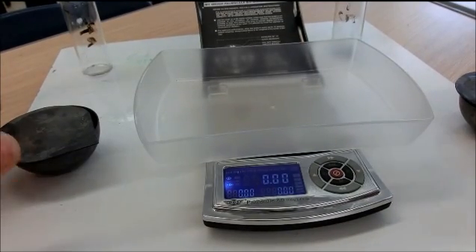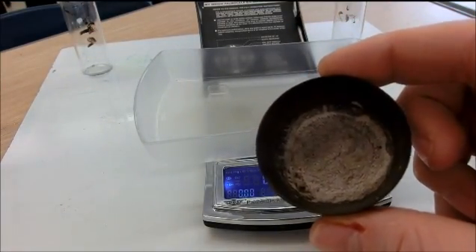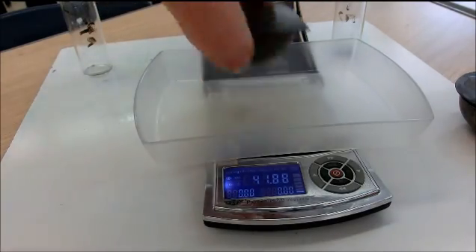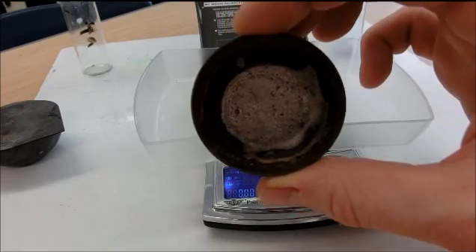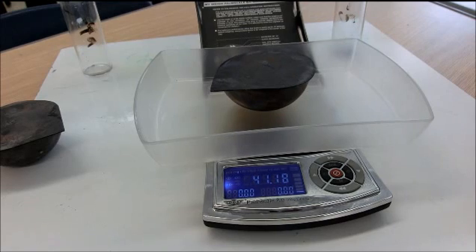Both crucibles and lids have cooled. There is 3B4's zinc and chlorine compound inside the crucible — with the lid, it has a mass of 41.88 grams. Here is 4B5's class — there is the compound — and crucible and lid weigh 41.19 grams.